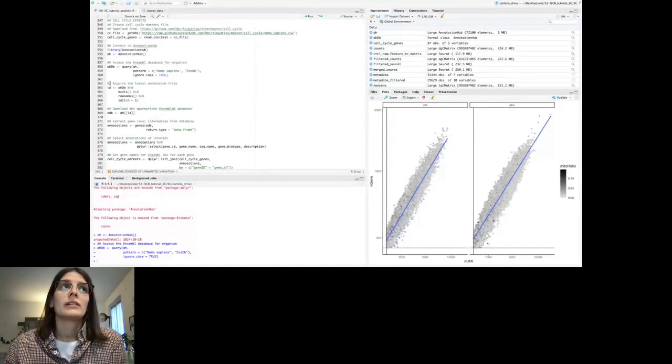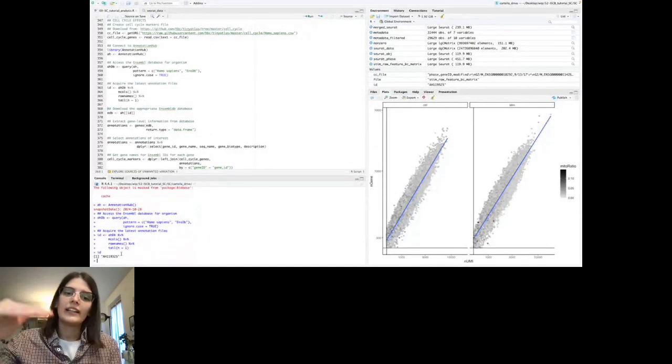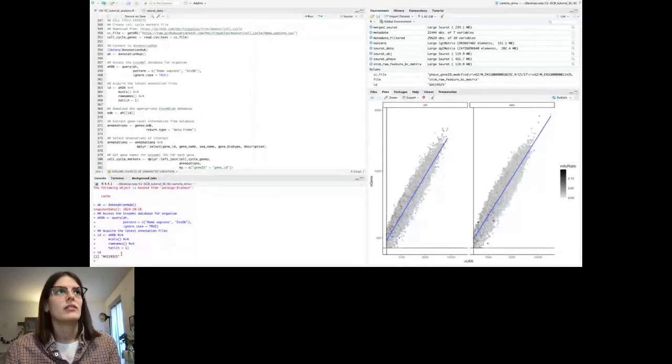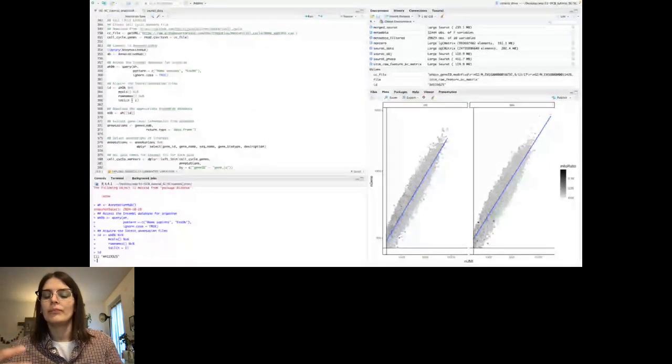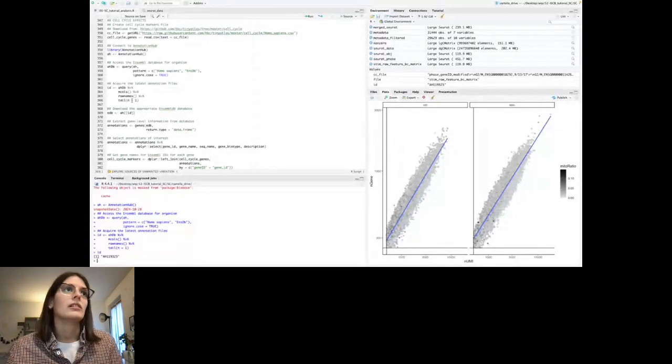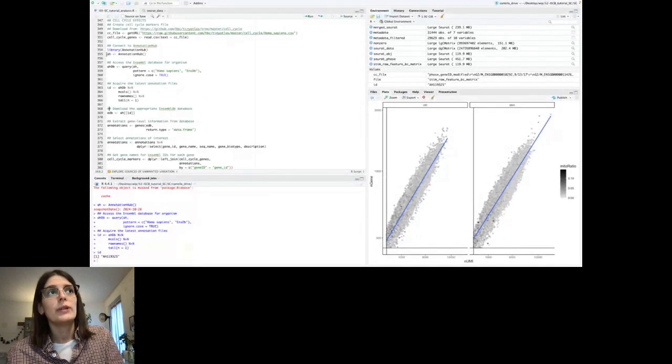So in this command, we get, and I will show you, the code for the latest annotation, so it is the most updated. We queried the Ensembl database for Homo sapiens, which gives you a list of versions of the database, and then we took the last one, the most relevant, updated version. So then we can query it. We go to the AnnotationHub and we extract the annotation relating to our ID, which is the latest one, and we save it.